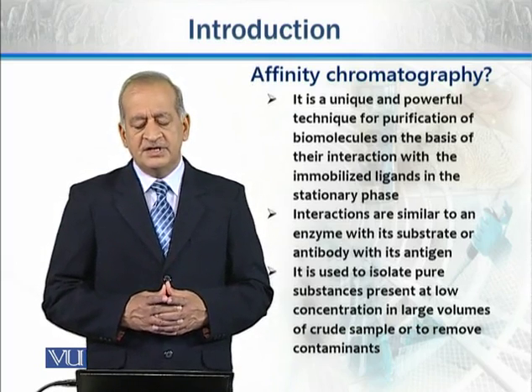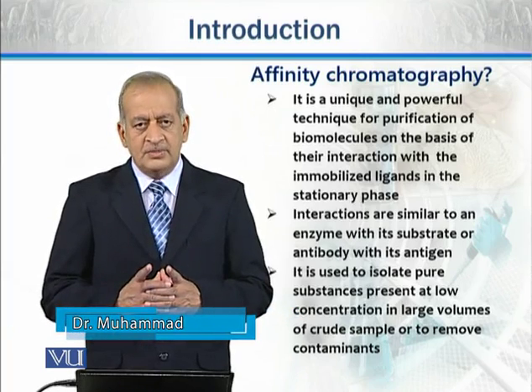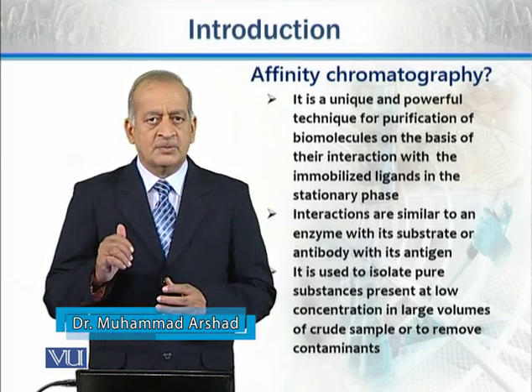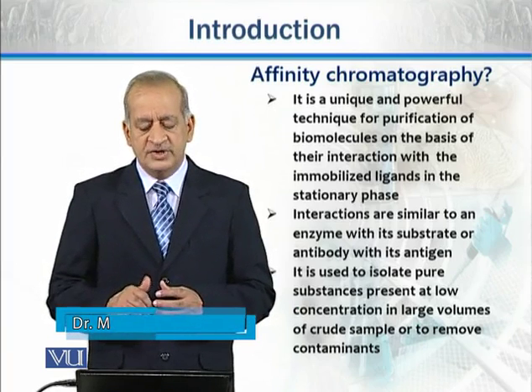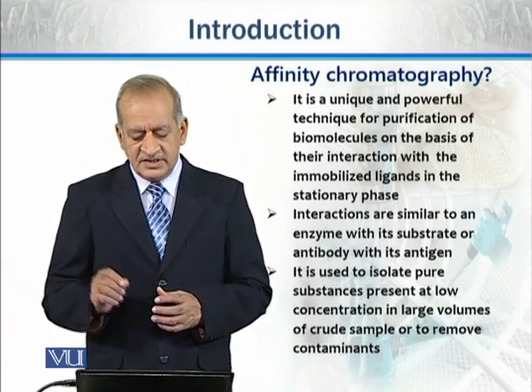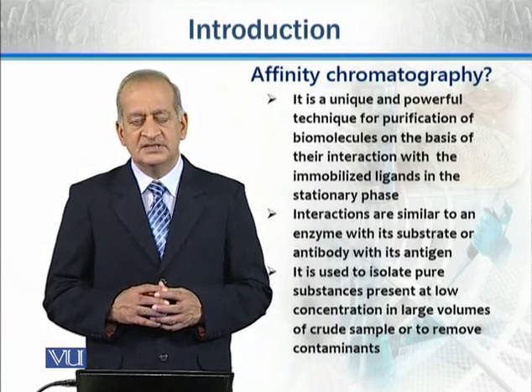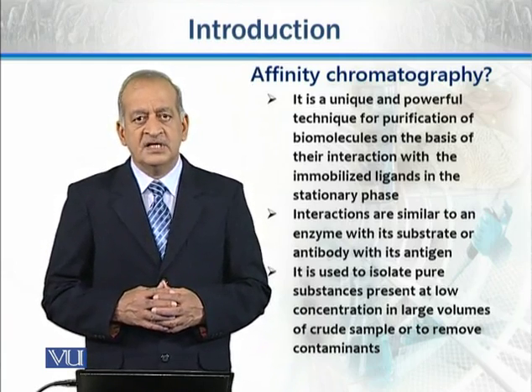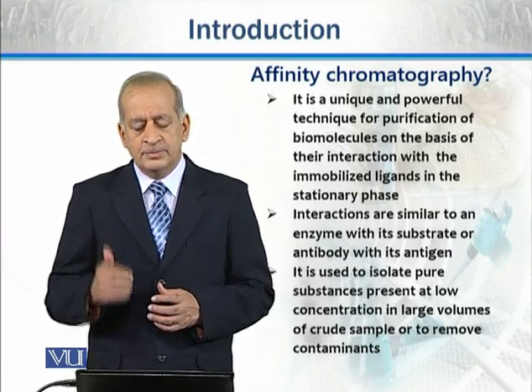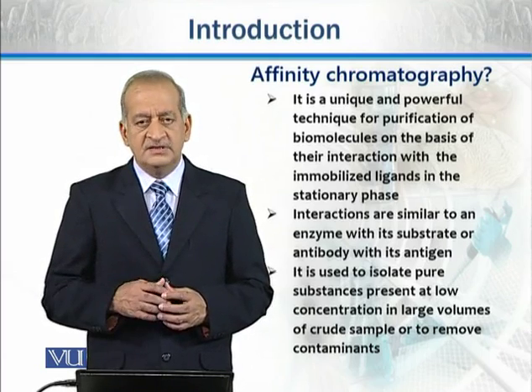So what happens here is that we bind some ligand with the stationary phase, and when some mobile phase passes through it, some components present in the mobile phase interact with these immobilized ligands present in the stationary phase, and in this way those compounds are bound with these ligands.